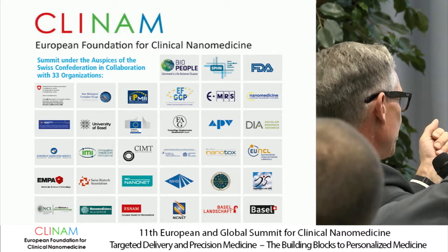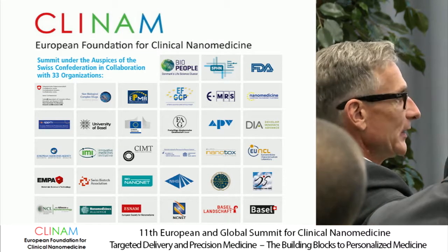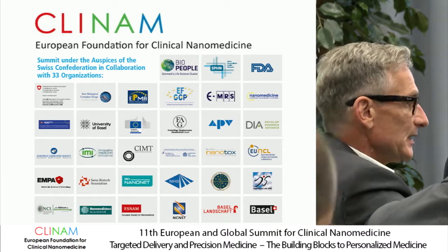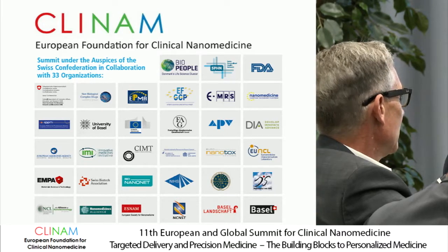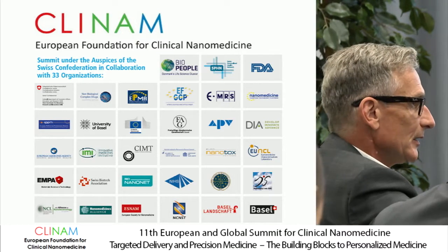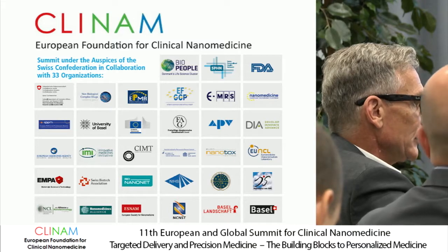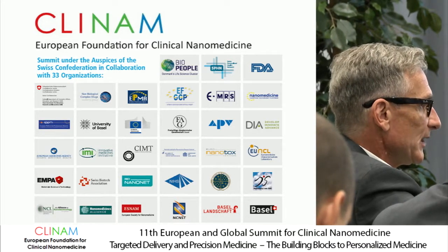And I think Jeff mentioned it, for what do you need it for, and what is critical in the context of the product, as you either design a simple and, let me call it, inexpensive release method that you can apply, that gives you not necessarily detailed characterization, but if you have a stable process, you're not worried about it because you've done that before.